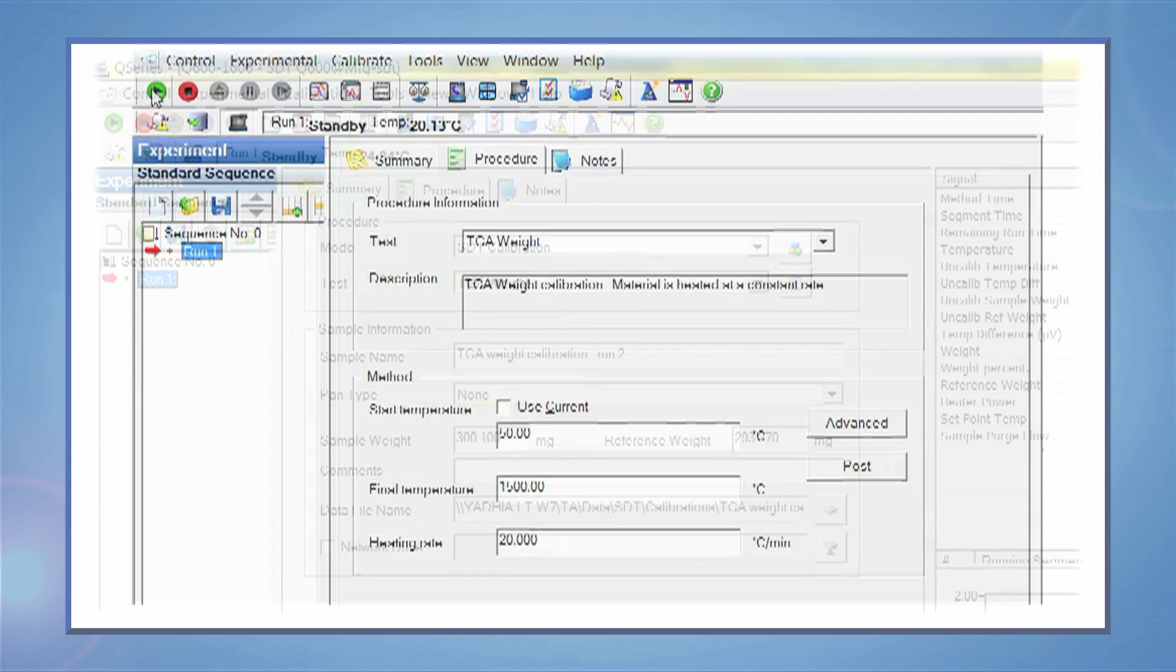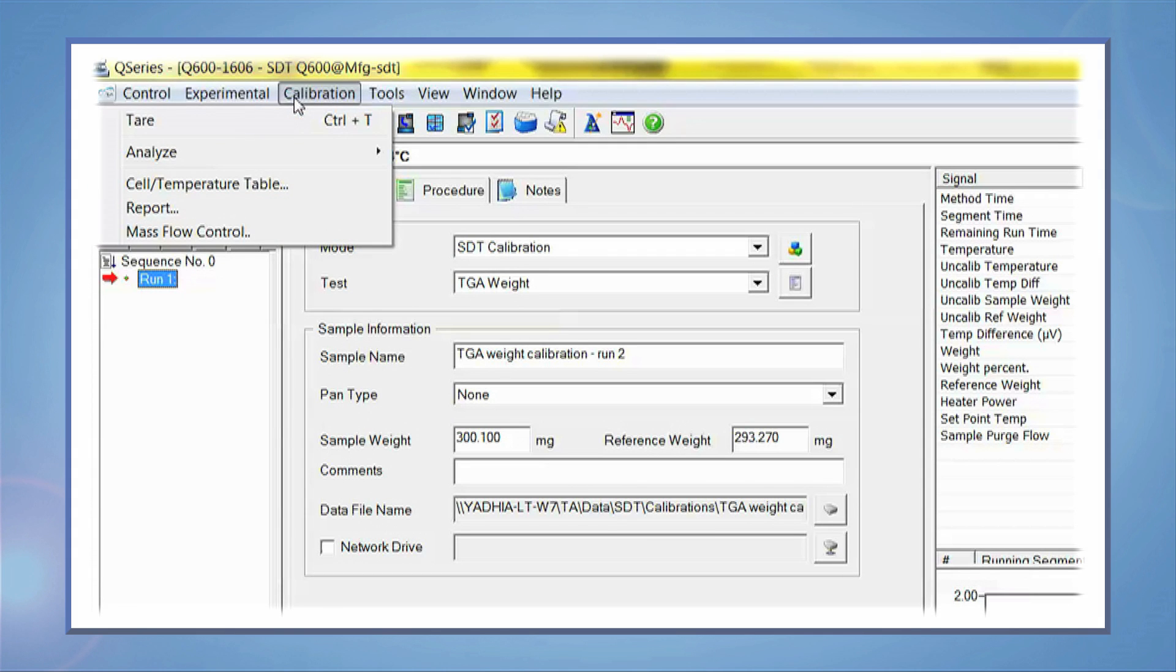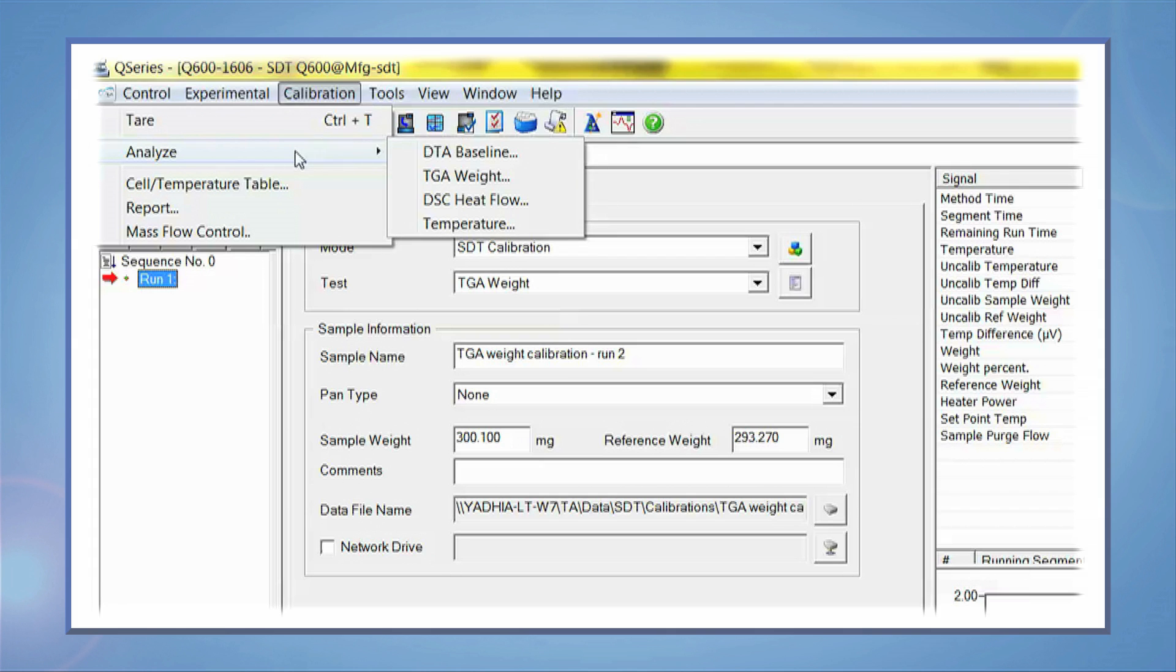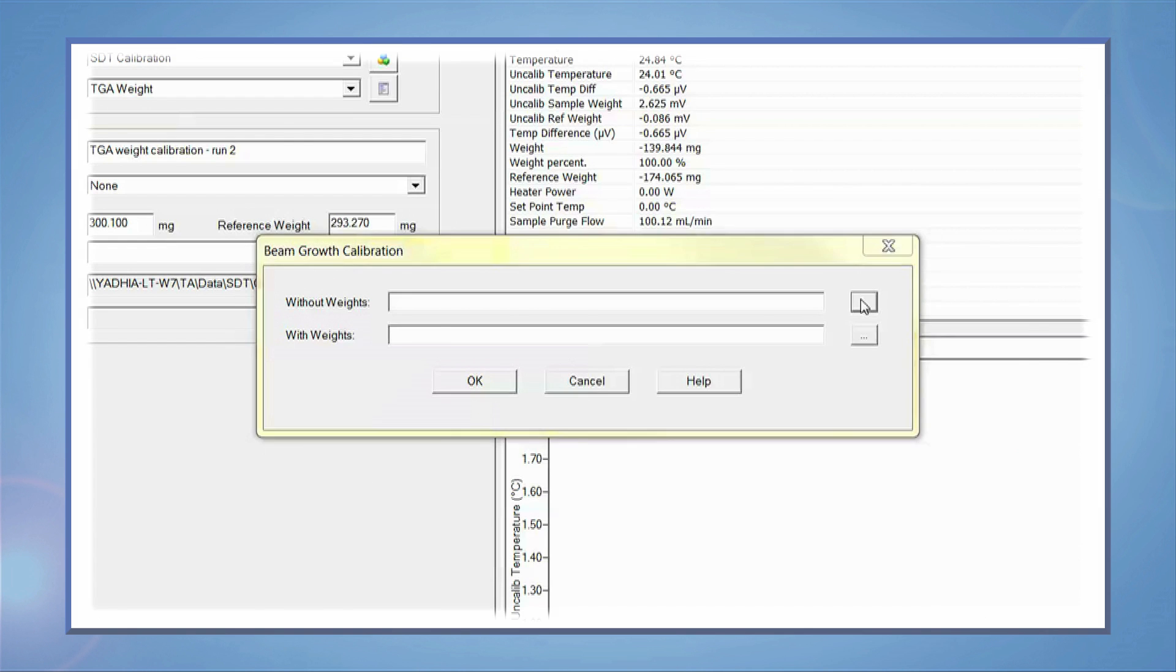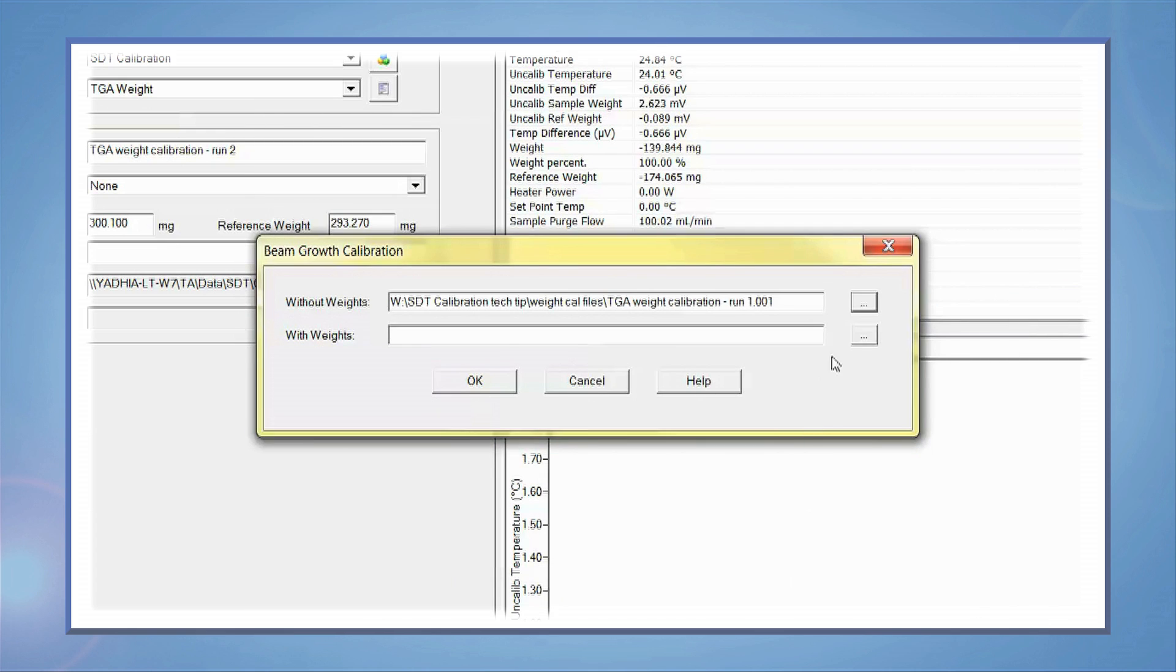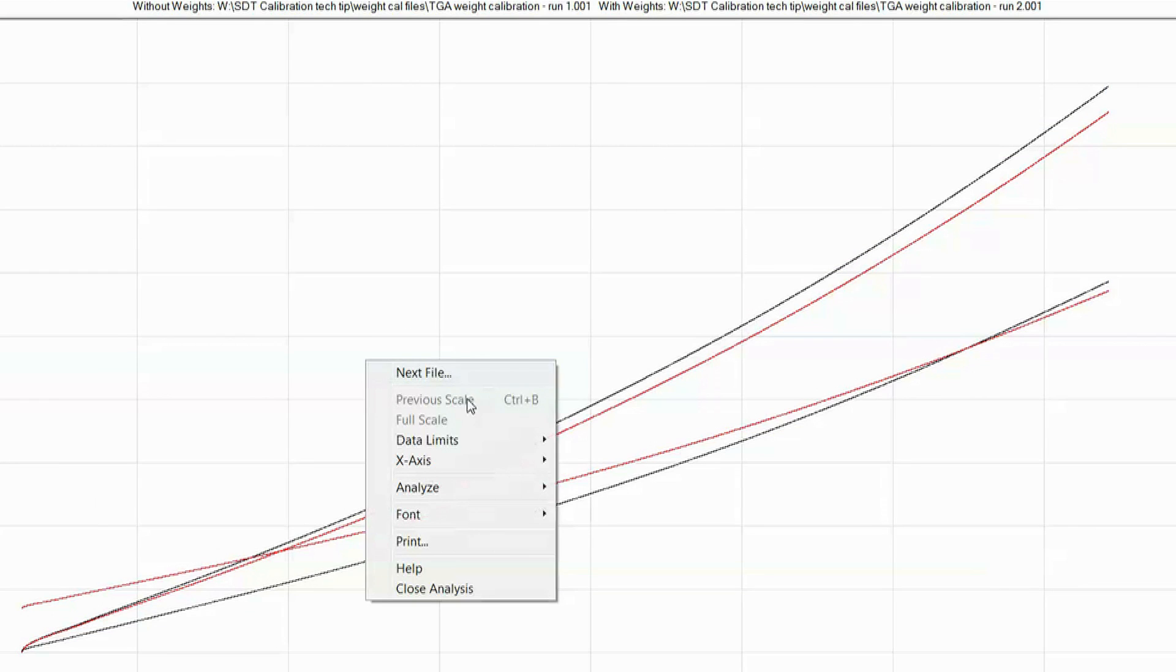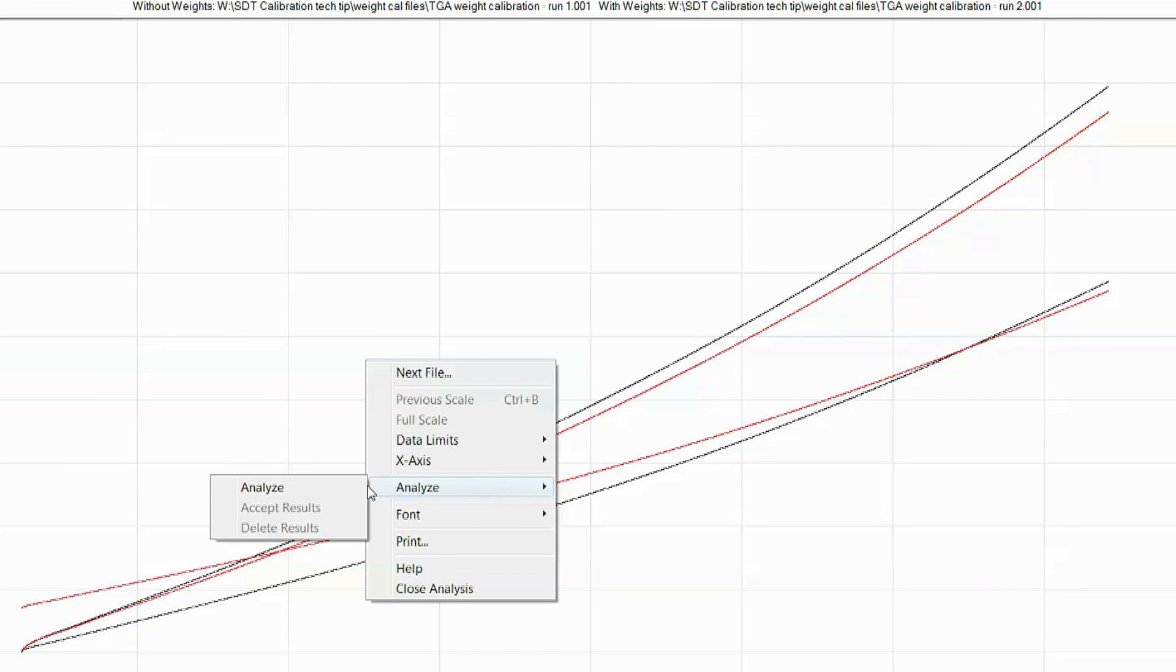At the end of both runs, select calibrate, analyze, TGA weight. Select the appropriate files. Right click on the screen and select analyze.